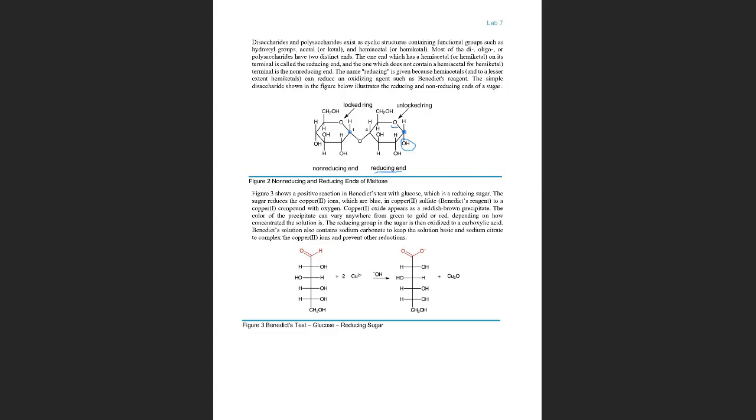So here is the reaction of the Benedict's test. What is really happening? You need to learn this reaction. So you will have in your tube, let's say, for example, glucose. Glucose will give you a positive test. What you need to know in this experiment is what is the signal, what is the change in color when you do the Benedict test.